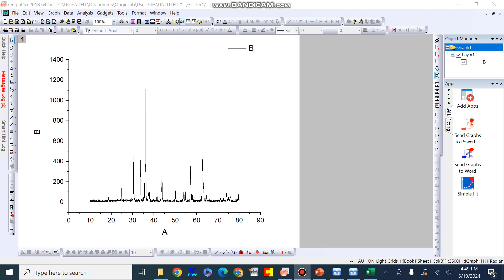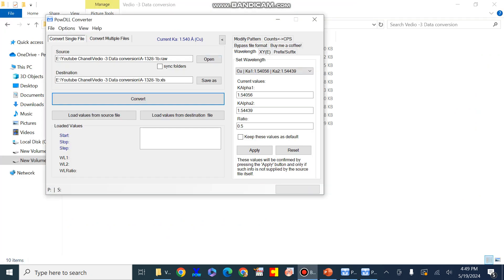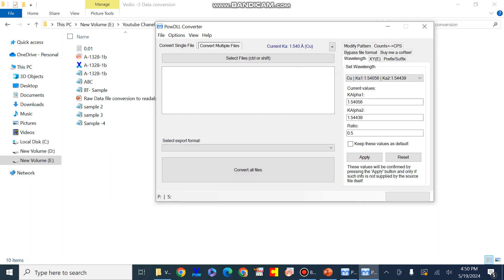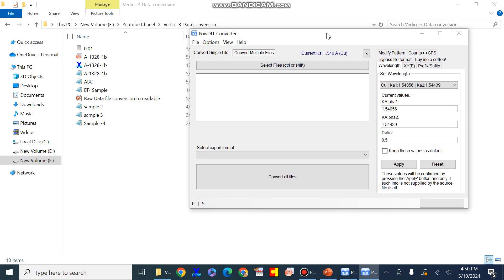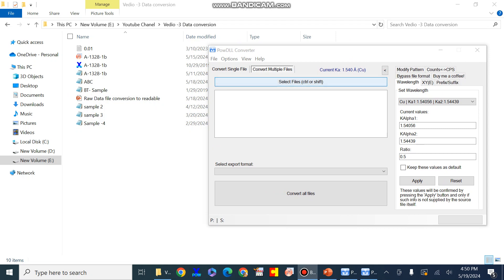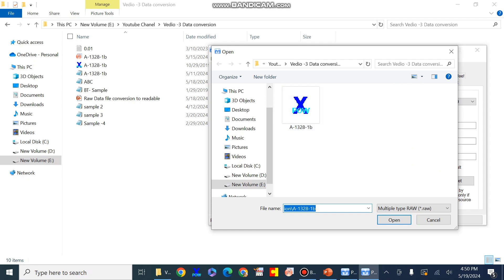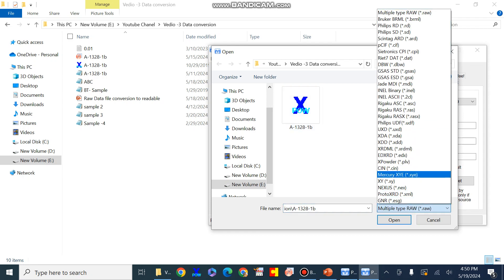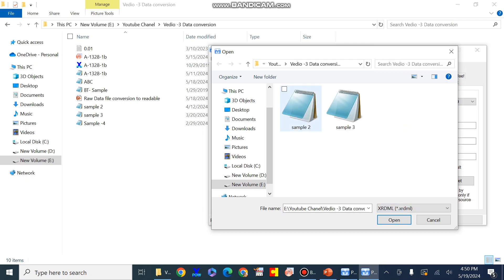It is a suitable and convenient way to convert the raw data file from one form into another. You can also convert multiple files at once with the help of this PowDLL software. I will show you that I can convert multiple files into Excel format. Just press on Convert Multiple Files, then select the files or drag the files. From here you can select the format in which the files currently exist — here I will select XRDML.